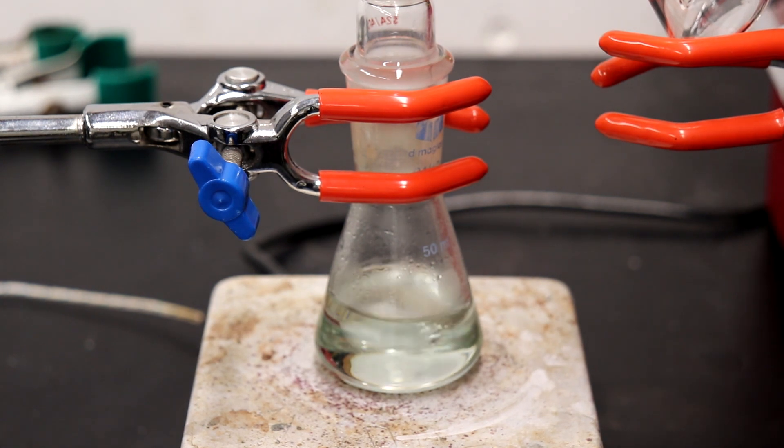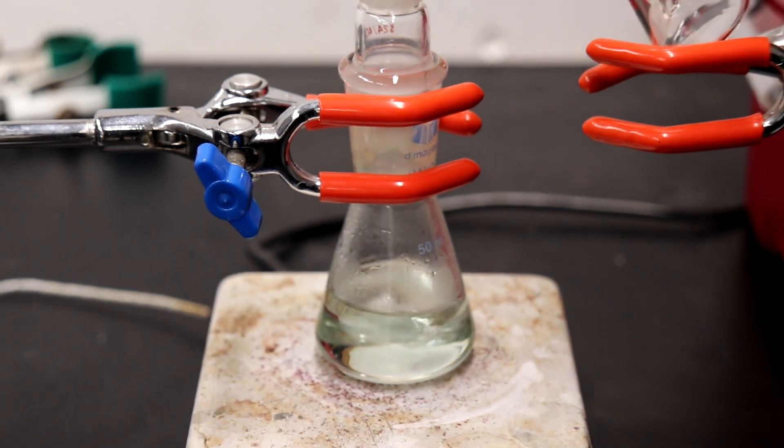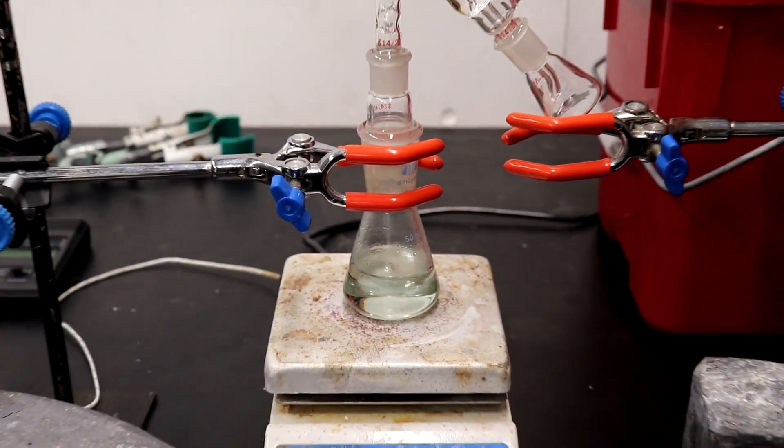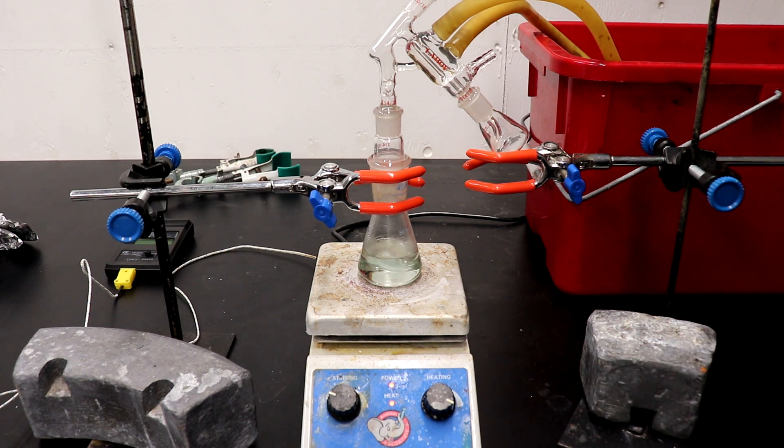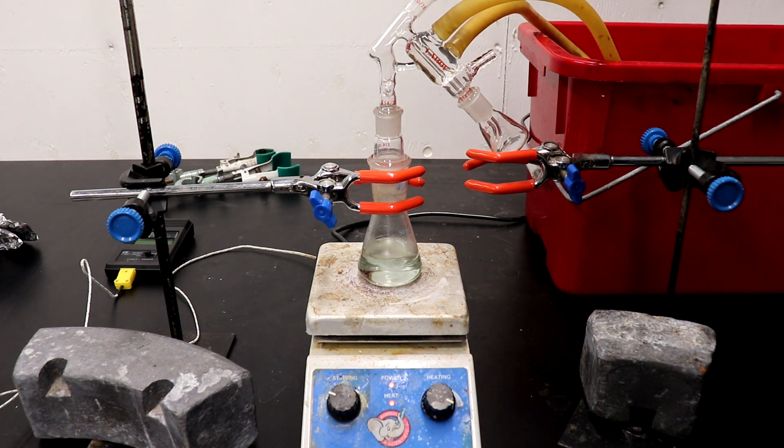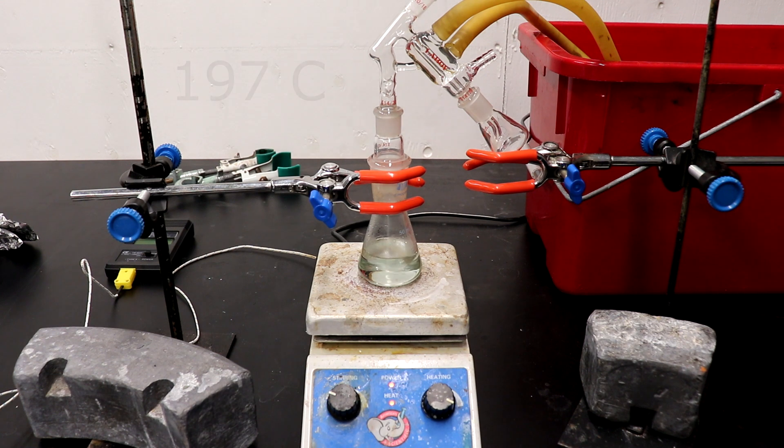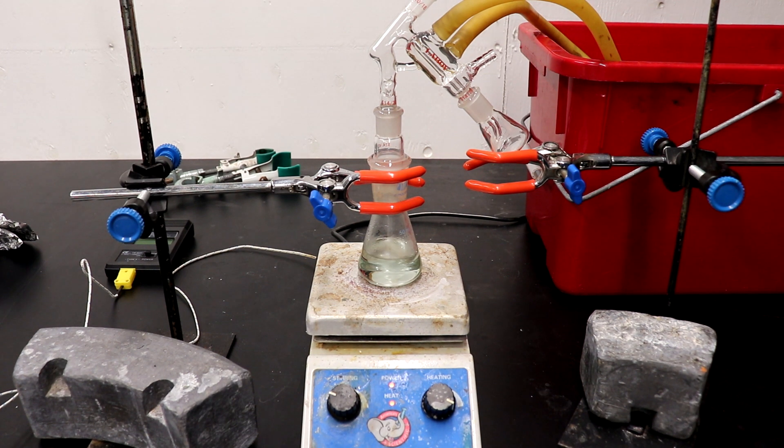I put the 1,4-dibromobutane on the hot plate, and I've set up for a short path distillation, and we're going to be distilling off the product to purify it further. Definitely want to have a short path with this because the boiling point is very high, 200 degrees Celsius in fact. We're going to be collecting some forerun likely before, so I set up with a smaller receiving glass, and then I'll switch out for a 50 ml Erlenmeyer or a 50 ml ground bottom after that.